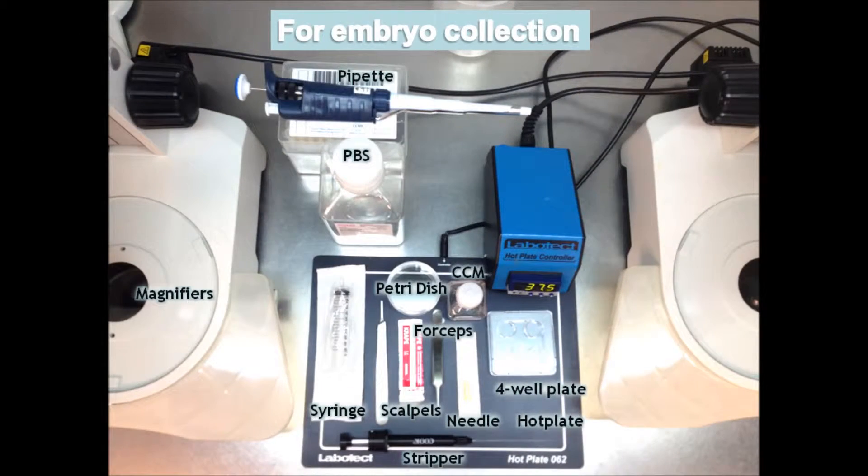To collect the embryos, we will need a dissection microscope, pipettes, PBS, syringe, scalpels, petri dishes, forceps, co-culture media, needles, a four-well plate and a hot plate set to 37 degrees.